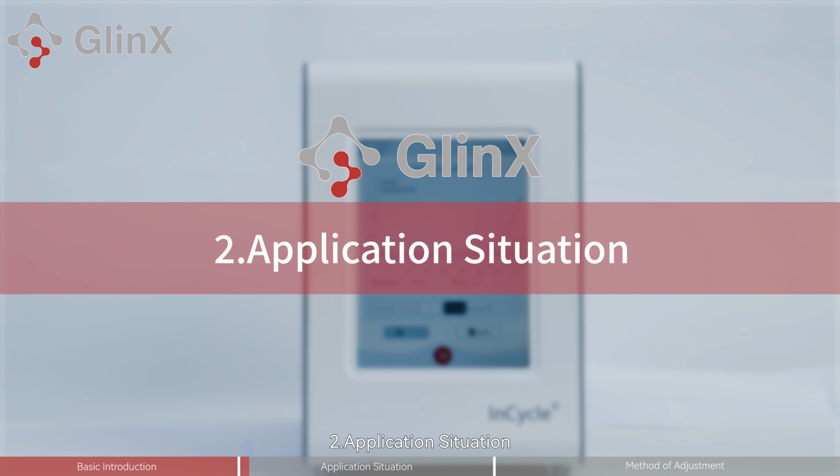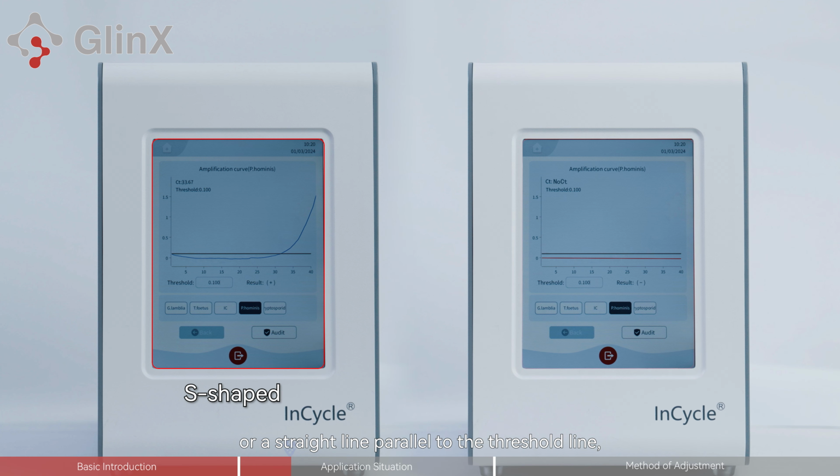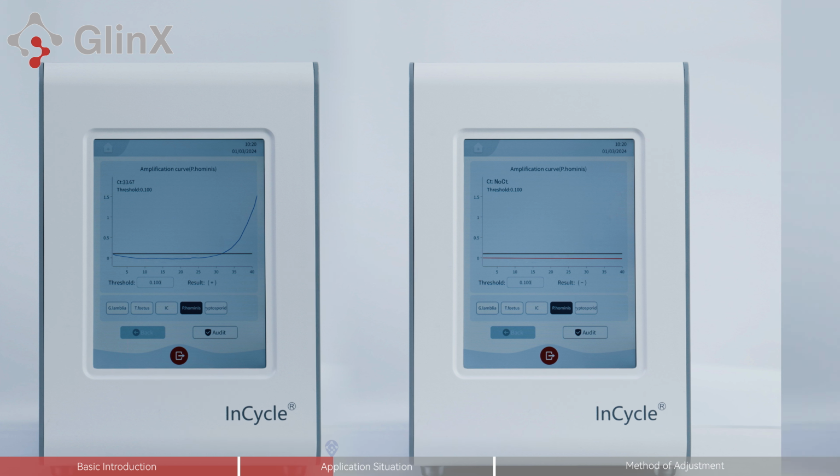2. Application situation. After the detection, if the amplification curve is a typical S-shaped or a straight line parallel to the threshold line, the threshold does not need to be adjusted. The following two cases involve threshold adjustment.